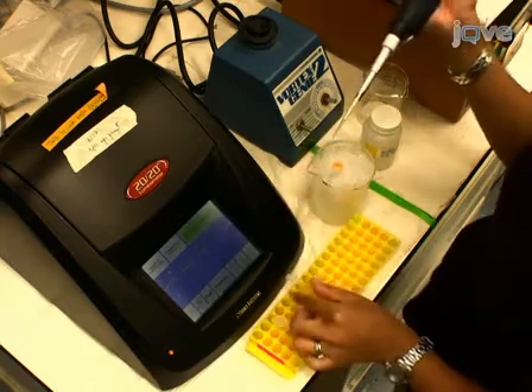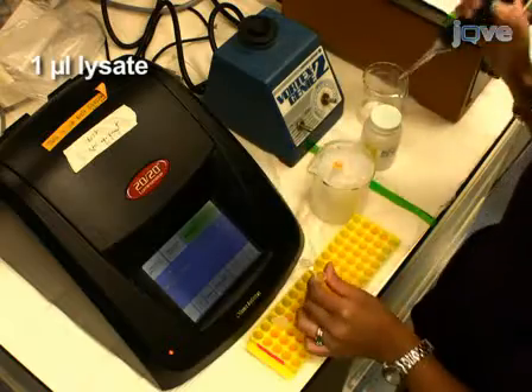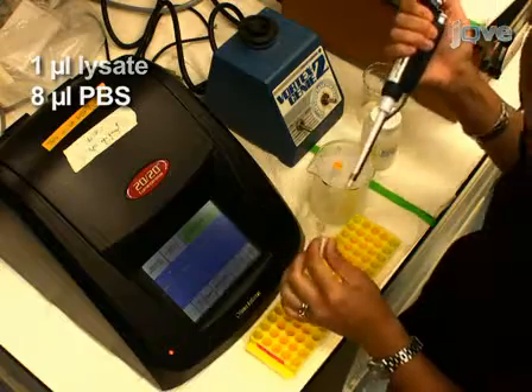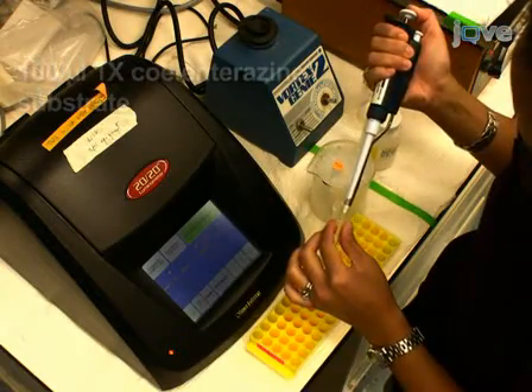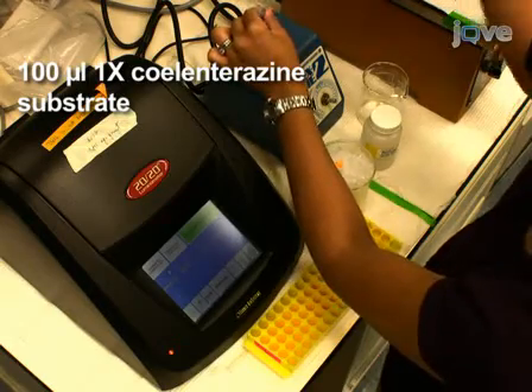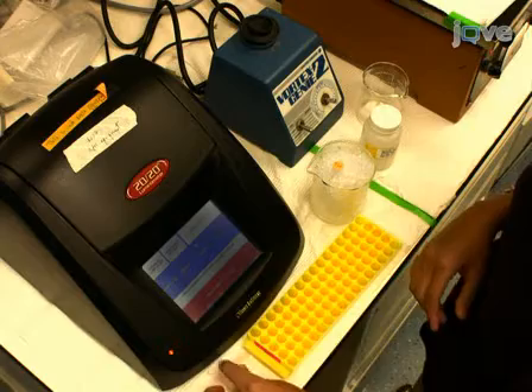To measure the light units (LU) of the lysate, dilute 1 µL of lysate with 8 µL of PBS in a new microfuge tube. Directly add 100 µL of 1x coelenterazine substrate to the diluted mixture, and immediately measure luminescence in the tube using a tube luminometer with a 5-second read.